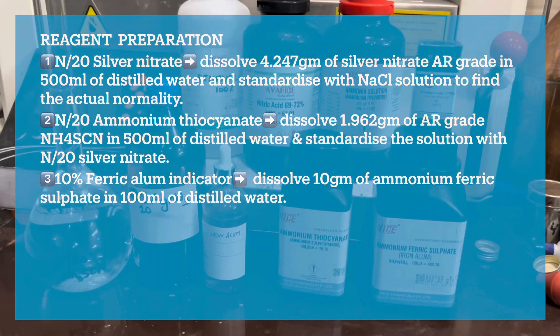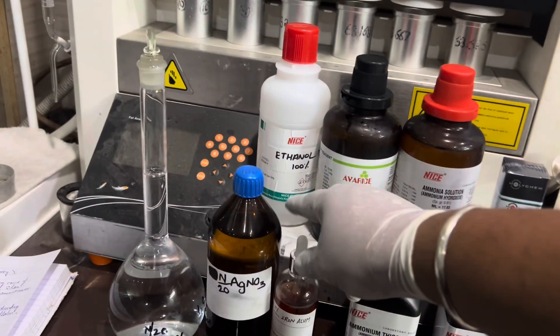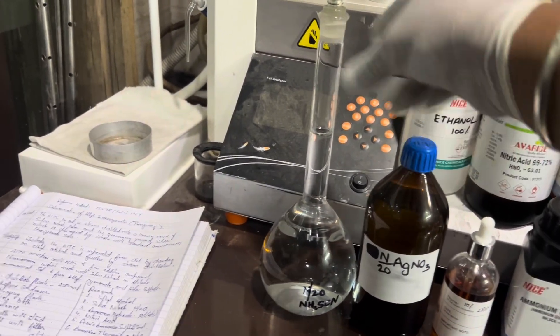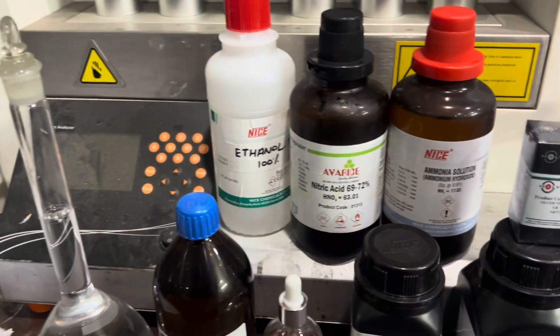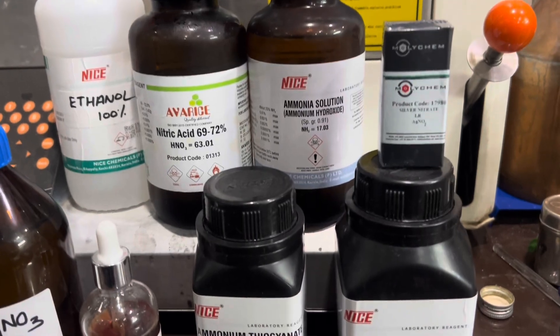The reagents that we have prepared are ferric alum as indicator, N/20 silver nitrate, and N/20 ammonium thiocyanate. The chemicals required are ethanol, nitric acid, and ammonium hydroxide.